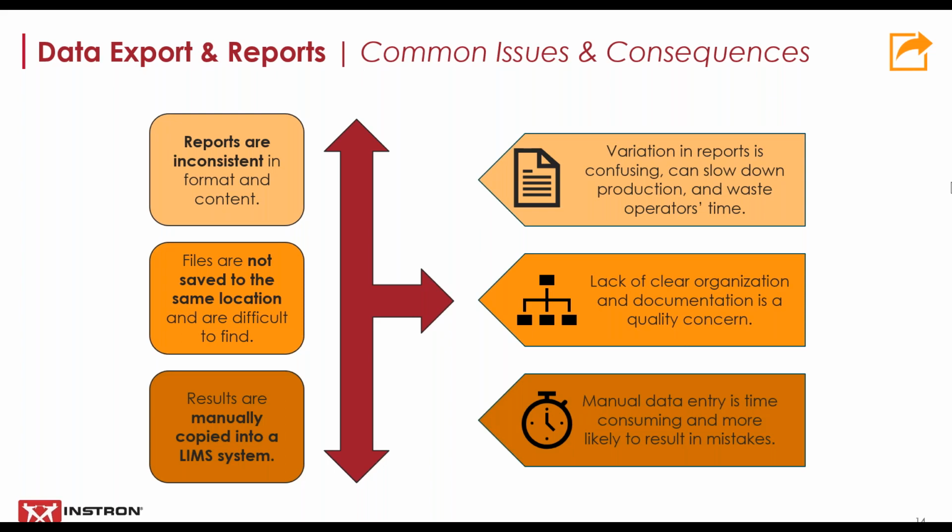In general, we've found that reports, exports, and report templates can be underutilized or sometimes unknown functions of Bluehill. Like many of the topics we have discussed today, a simple initial setup process can save a lot of time down the road and ensure greater efficiency and consistency.